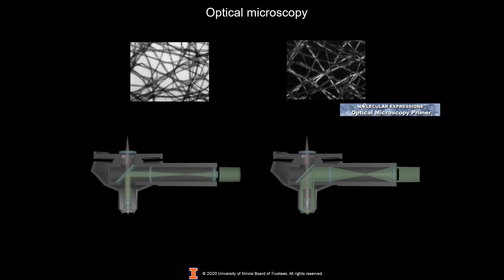One example of those contrast methods is dark field illumination, which you can see in the right scheme here, in which the sample is illuminated from the sides, and we use the light scattered by it, while the directly reflected or transmitted light is blocked from the detector. Spectroscopic signals like fluorescence and Raman are often used as contrast methods as well.